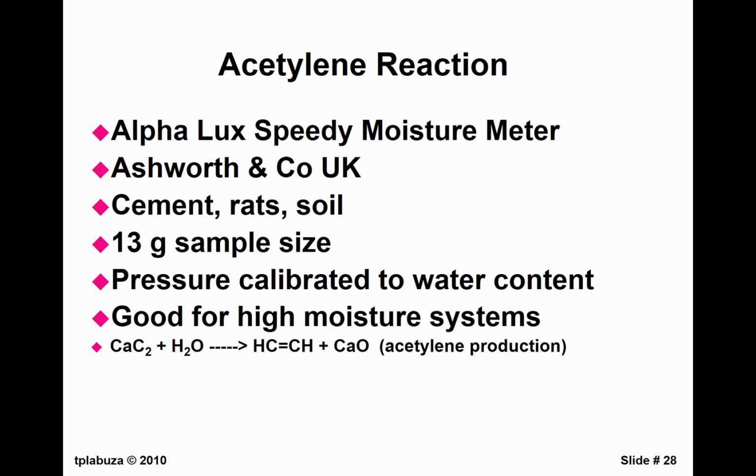Unfortunately, I didn't find a picture of it. It's one of my set of slides. The Alpha-Lux Speedy Moisture Meter. It's a British instrument.